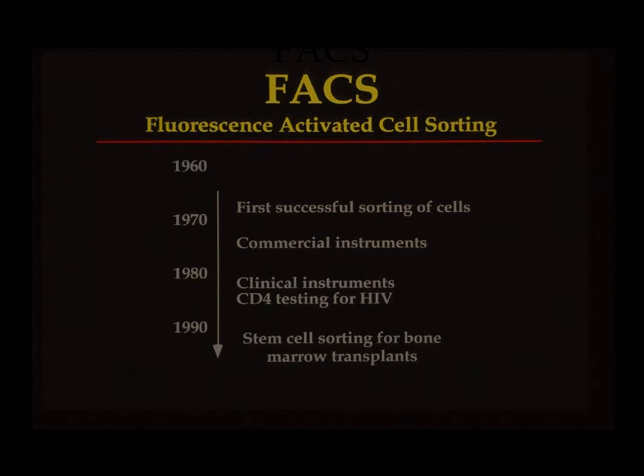I don't think she's here this evening, or this afternoon, or today, or during this meeting. Anyway, then the patent was made and licensed to BD with that NCI, Cancer Institute contract that I'd gotten. The first commercial instruments came out in the very early 70s, 73, I believe.